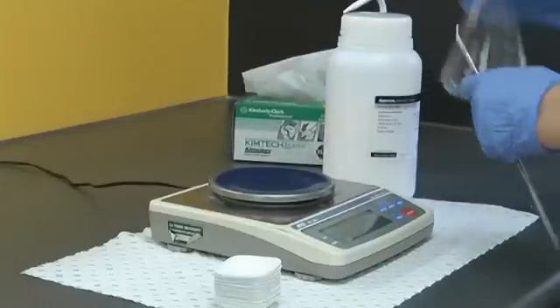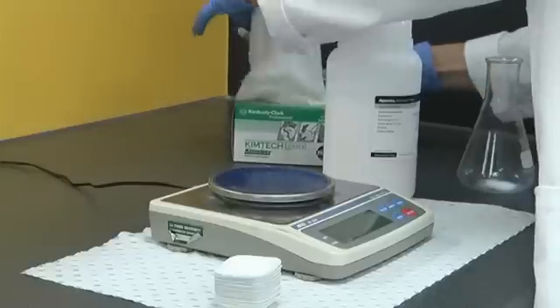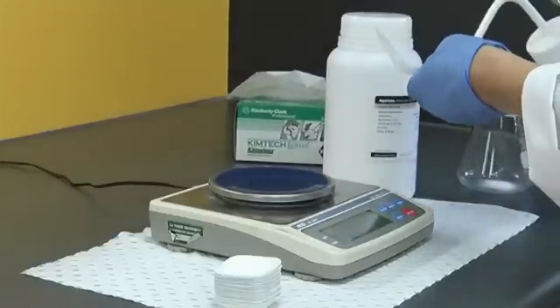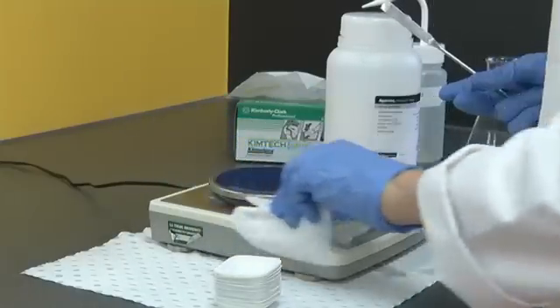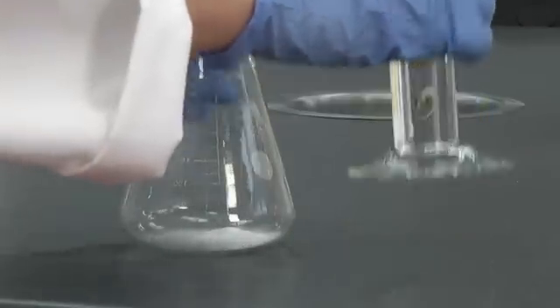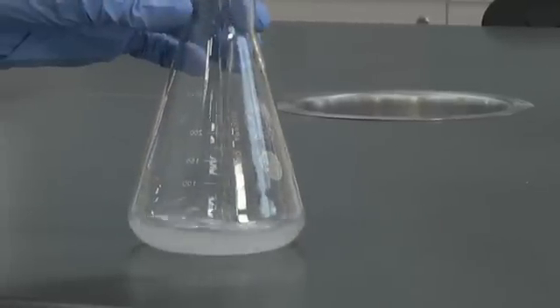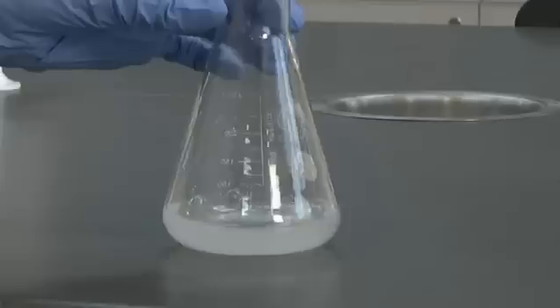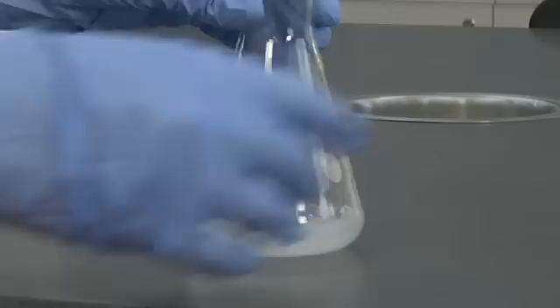After you finish weighing chemicals at the balance, please ensure that you clean up. Wipe the balance and the surrounding area with a damp tissue. Add the appropriate volume of running buffer to the agarose in the conical flask — in this case 60ml — then swirl the flask.